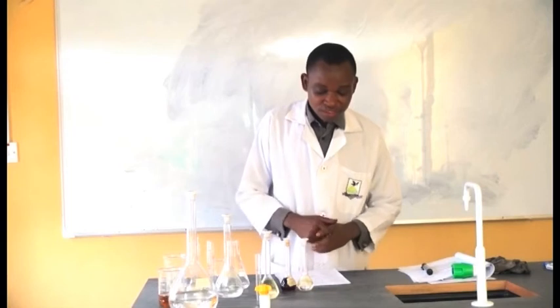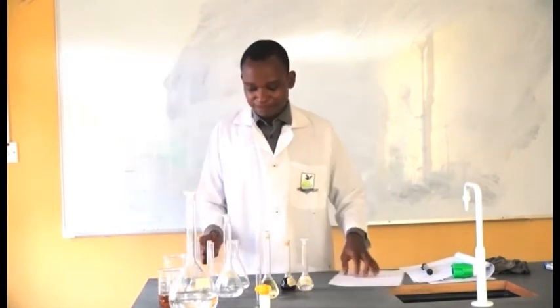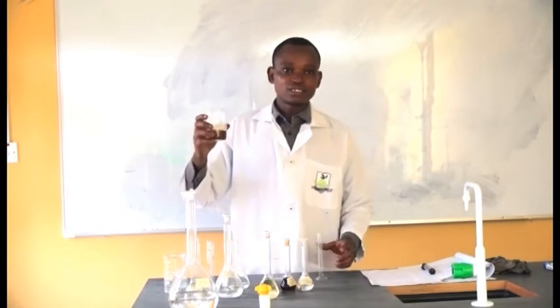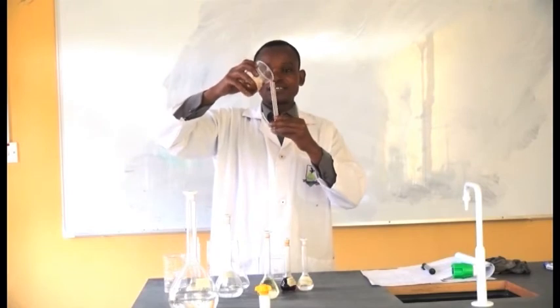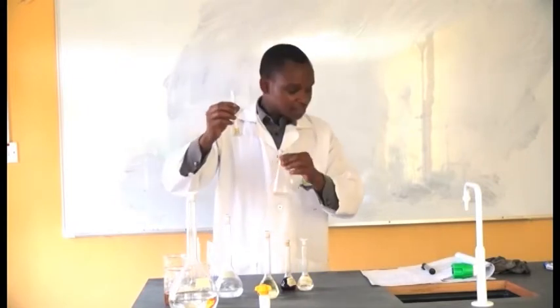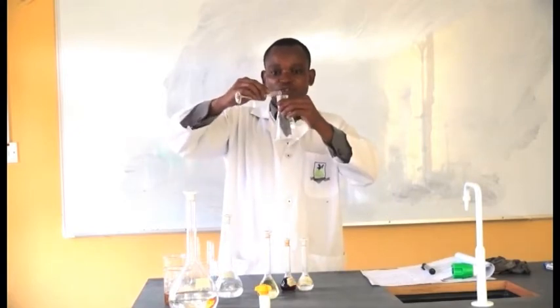In this procedure, the first step says weigh one gram of the sample into a conical flask. One gram is also equal to one ml. So I'm going to measure one ml of this fat sample into the conical flask.